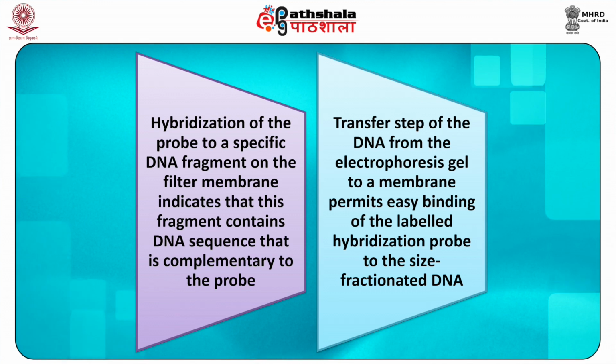The transfer step of the DNA from the electrophoresis gel to a membrane permits easy binding of the labeled hybridization probe to the size fractionated DNA. It also allows for the fixation of the target probe hybrids required for analysis by autoradiography or other detection methods.